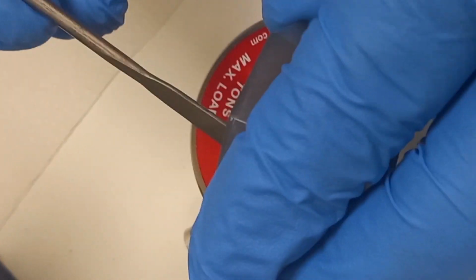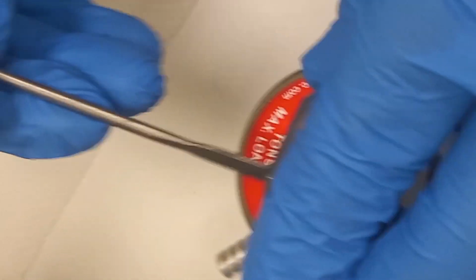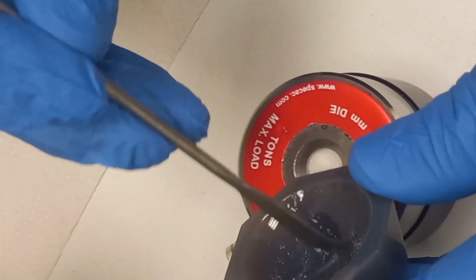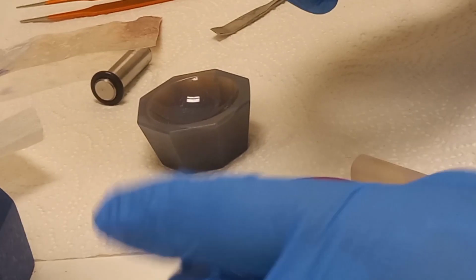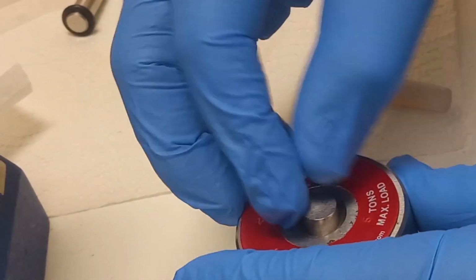FTIR spectroscopy is widely used in various fields such as chemistry, material science, pharmaceuticals, forensics, and environmental analysis for qualitative and quantitative analysis of samples, identification of compounds, and monitoring chemical reactions.